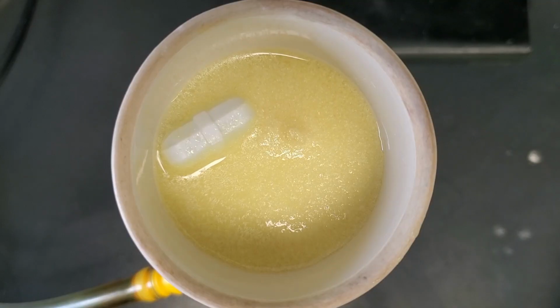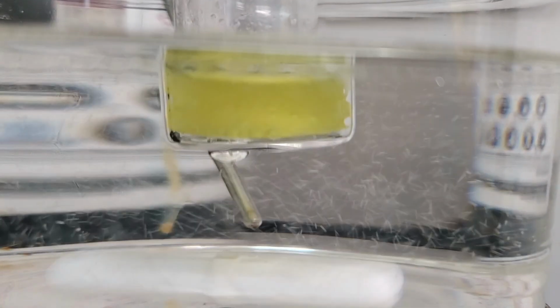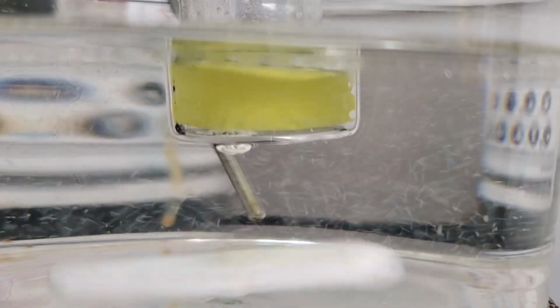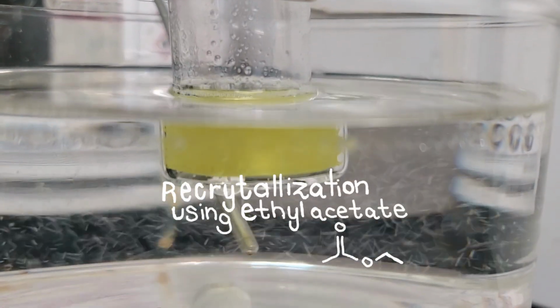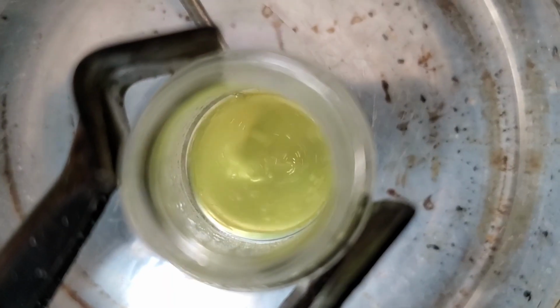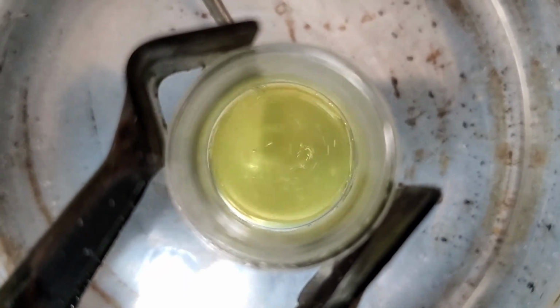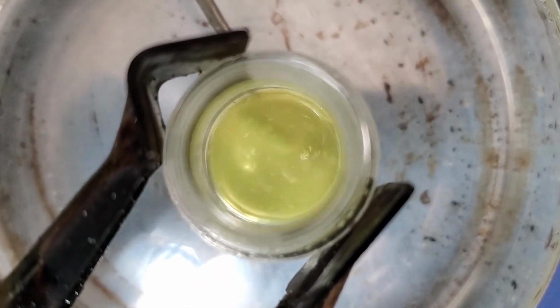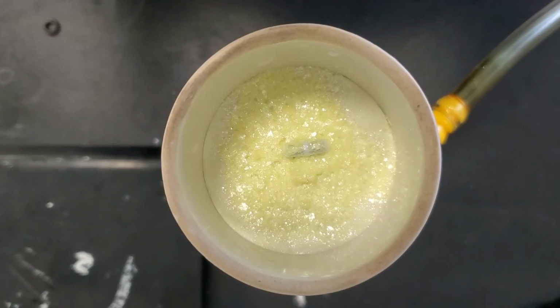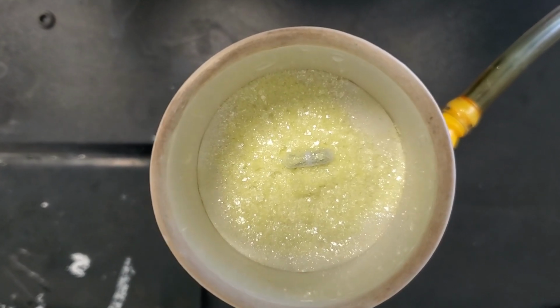The next step was recrystallization. I dissolved the crude solid in a minimum amount of hot ethyl acetate, then allowed the solution to cool slowly so crystals could form more cleanly. After the solution reached room temperature, I placed it in an ice bath to maximize crystallization, then collected the purified solid via filtration and let it dry thoroughly. Recrystallization is important here because it removes impurities and gives a cleaner product for analysis.